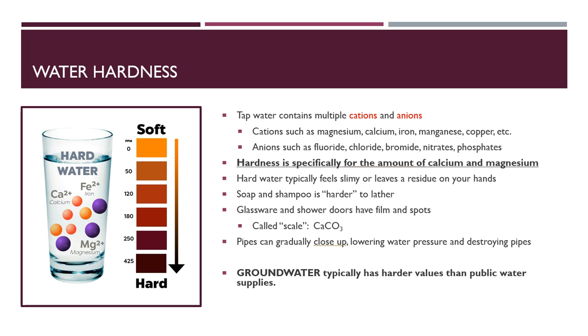Folks, that is what we are measuring in the water hardness lab. We are going to be measuring the cations, and these cations in particular are going to be magnesium and calcium. Now, we can measure other things as well: iron, manganese, copper, any type of metal. Any type of metal, we can measure them in a laboratory, but that's not really hardness. Total hardness, water hardness, we are looking at calcium and magnesium specifically.